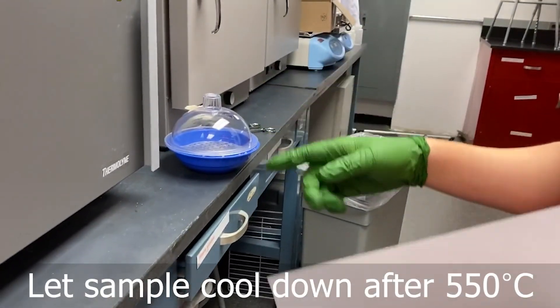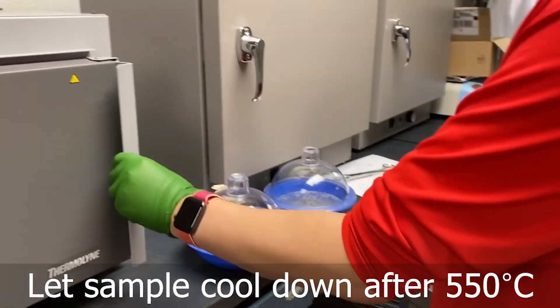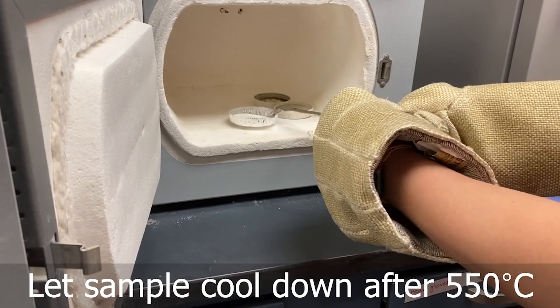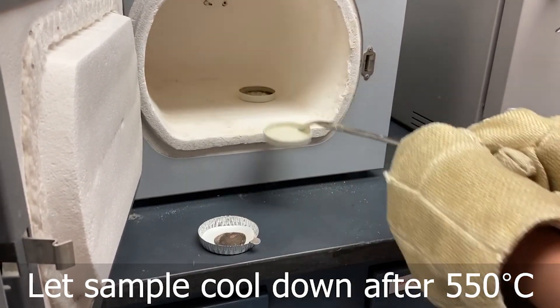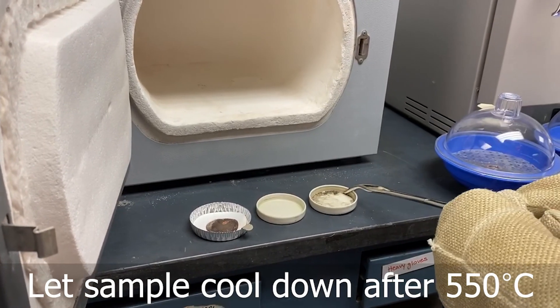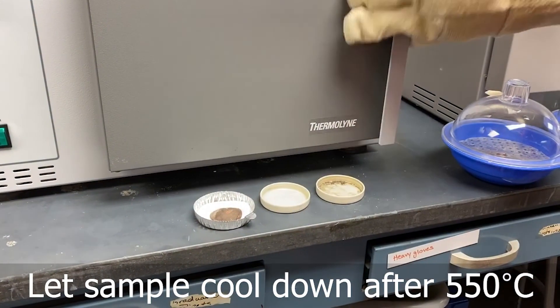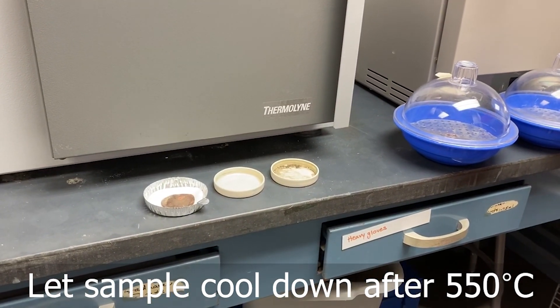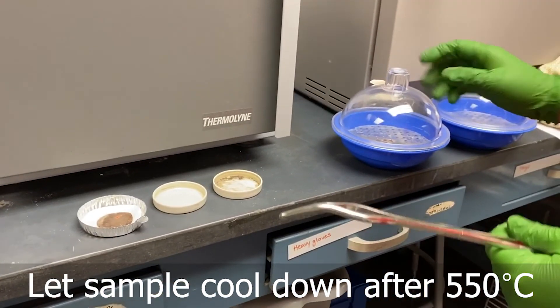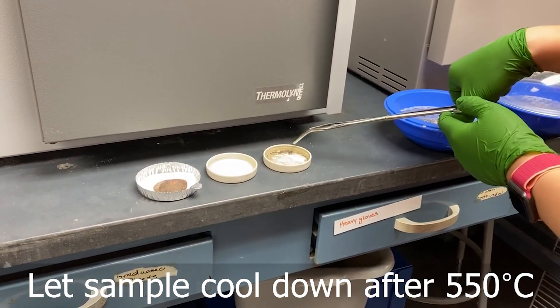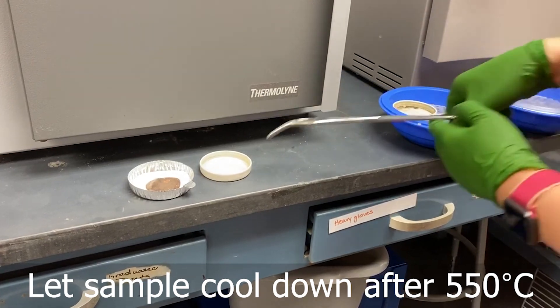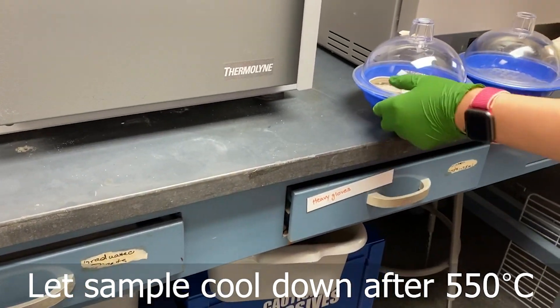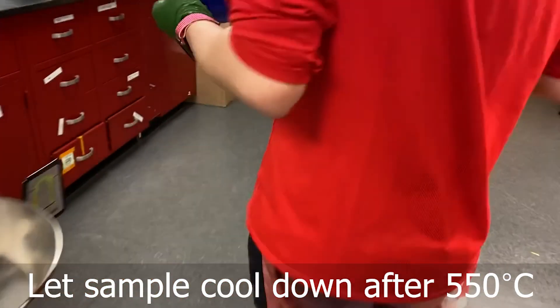And then we should wait this for about 15 minutes. So now it is after 15 minutes, we are going to take them out. And then make this air dry for several minutes. After that, we can transfer them into the desiccator to make them cool down to room temperature.